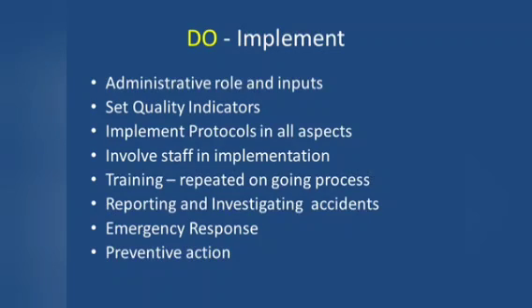Set the quality indicators by doing audits. How often should you do an audit? What are the quality indicators? And the frequency of the review should be put in place.